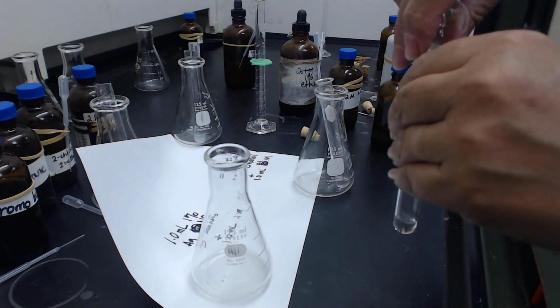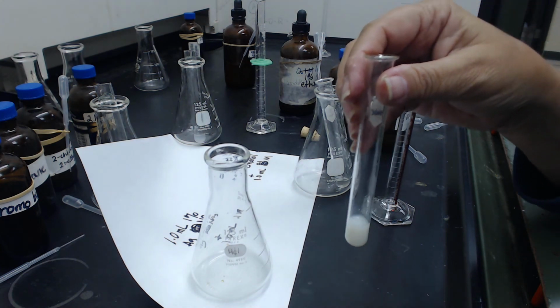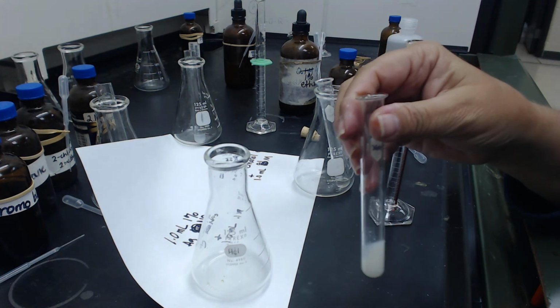So I'm going to start it, add it. Oh, it just happened immediately. I'm saying maybe 2 or 3 seconds.